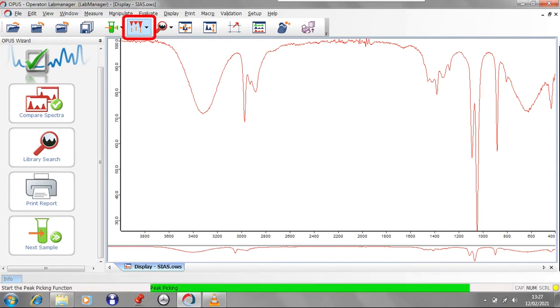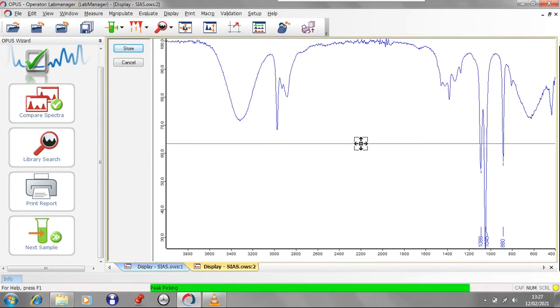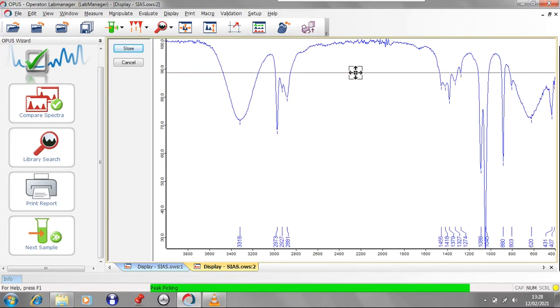Once you have your spectrum, peak picking is performed to give the wave number of each peak by clicking on the peak picking icon as shown here. You can make the system automatically calculate the most prominent peaks, or you can use the drop-down menu for interactive peak picking. This will give you a horizontal line to allow you to choose the transmittance below which to measure the wave number.